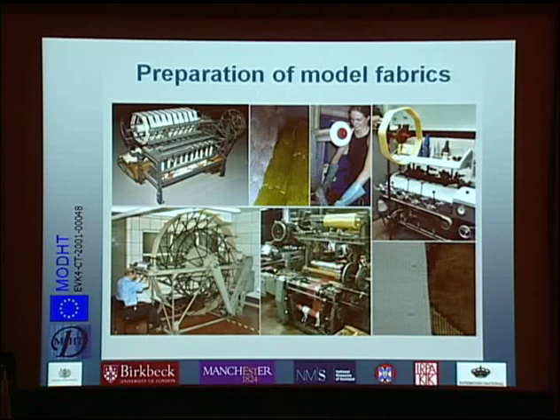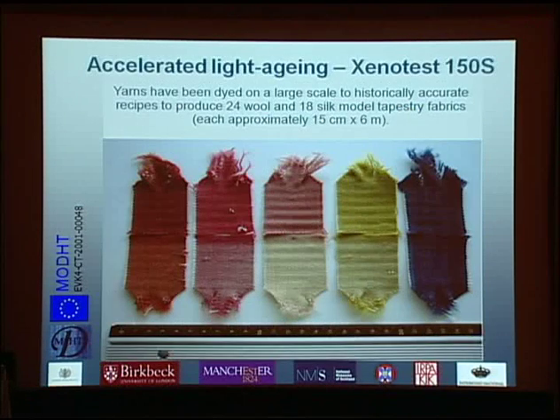Before we subjected any of these historic fibers to chemical analysis, we optimized all the techniques and tested them on model fabrics. And this slide shows an overview of how these fabrics were produced from winding hanks.